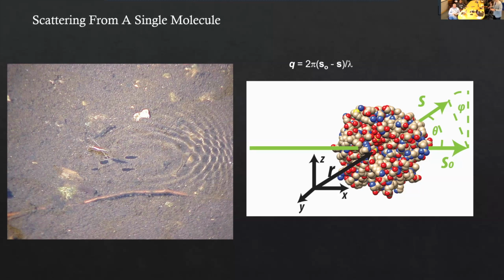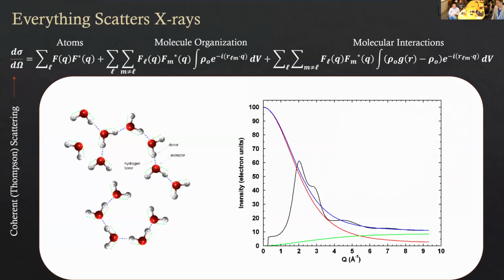All right, everything scatters. Sorry, updating on the Zoom. Excellent. Everything absolutely scatters, right? So you stick your finger in the beam, it will scatter. And I don't recommend that, but that will happen.